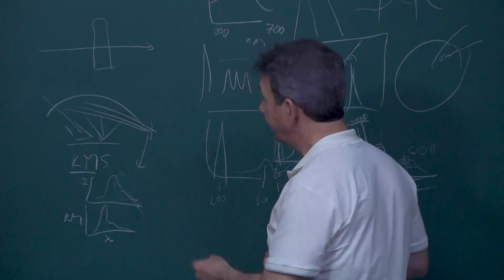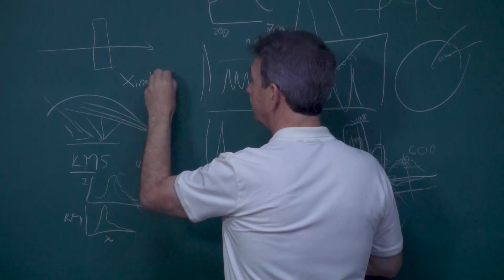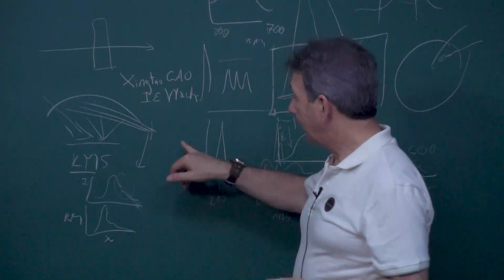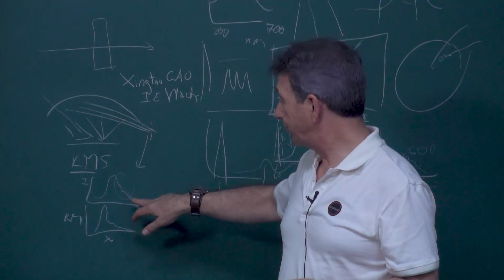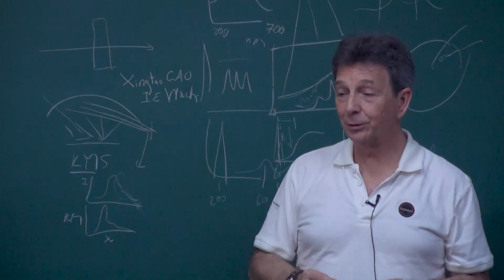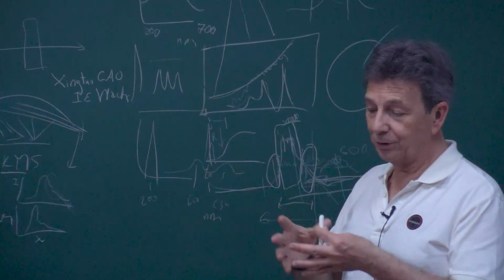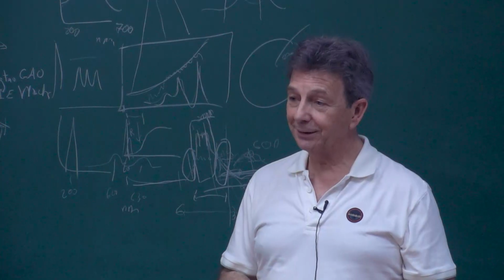Actually, there was a paper by Xingtao Gao and Israel Wachs about a very good method to calculate that. I can look for it and hopefully share it tomorrow. That was a very nice method, and it is the kind of equation we use to calculate that, because it really helps you tell the size domains and nuclearity, whether you have more polymeric or oligomeric units within a large solid material.